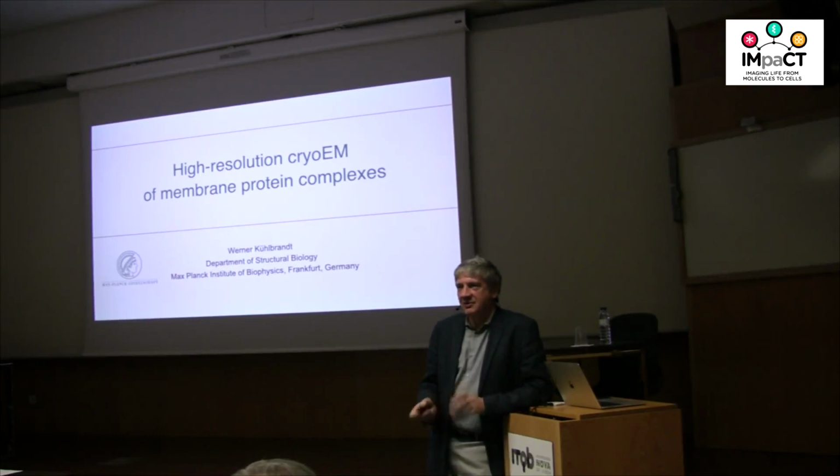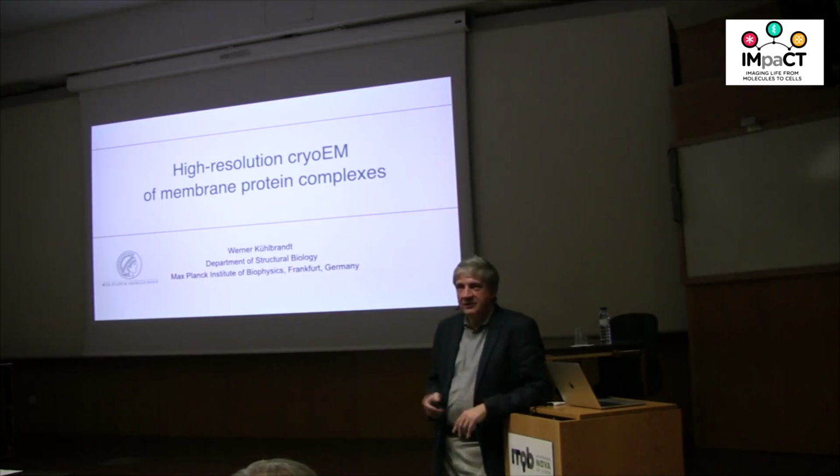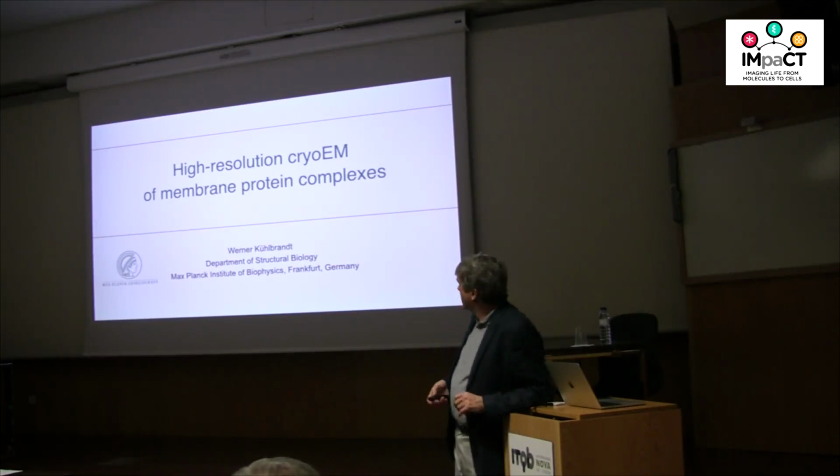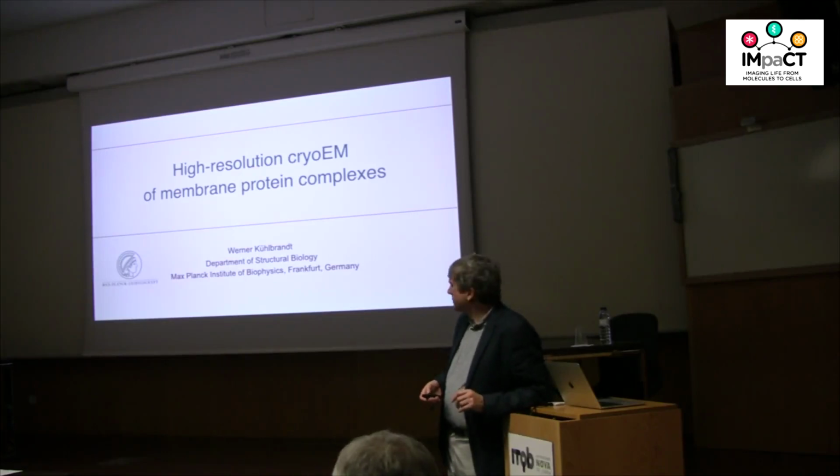So this is our main scientific quest: to apply cryo-EM to work out what membrane proteins look like, if possible in atomic detail, and from that, how they work. So that will be my talk today. I'll give you a quick outline.